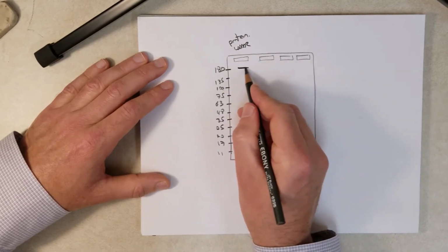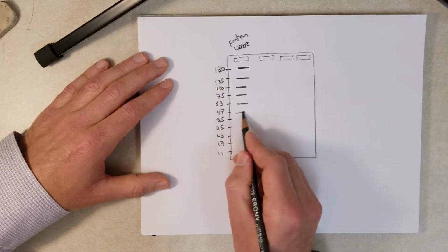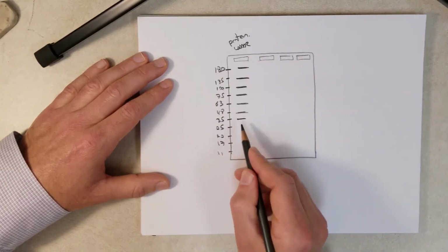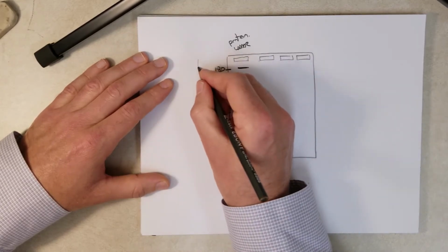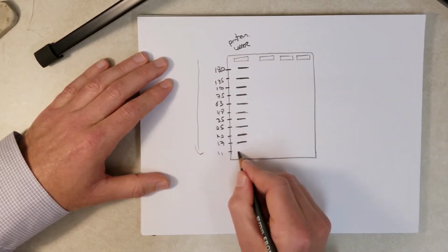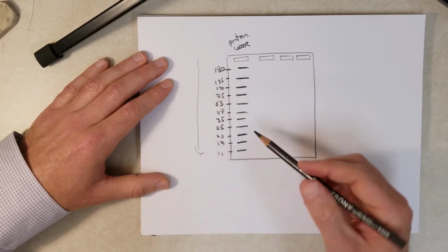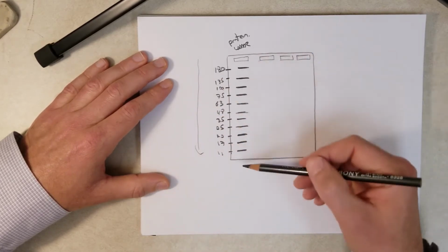And so if we were to perform electrophoresis, we load our ladder into there. We separate the proteins through the gel using an electric current. The smaller proteins with a lower molecular weight will migrate faster than the larger proteins, and we'll get a ladder that looks something like this.